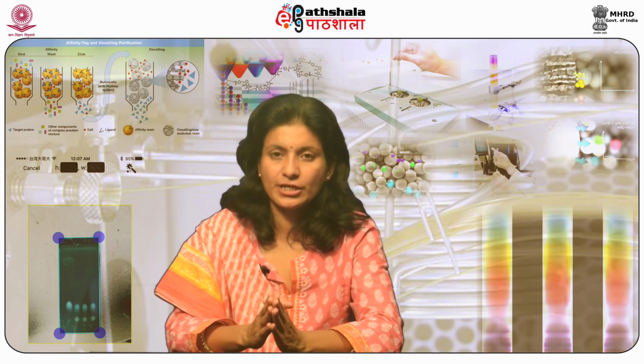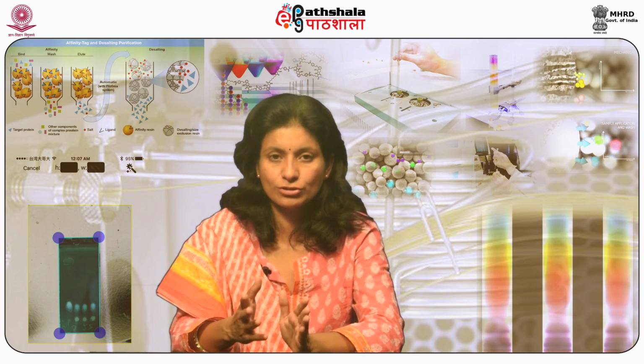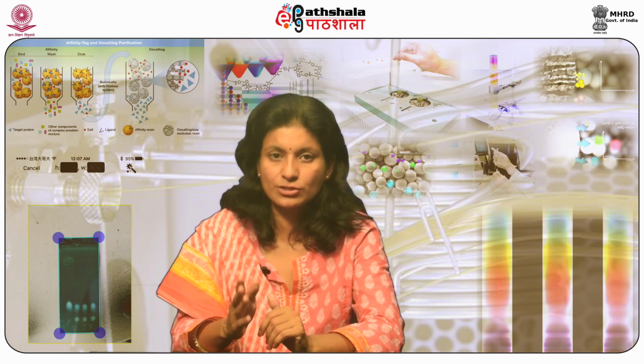Advantages of ion exchange chromatography. This approach has been utilized for the evaluation of anions and cations, implicating metal ions, hydroxyl compounds, peptides, organic acids, nucleotides, and alcohols, etc. It has been successfully applied to the investigation of deteriorated products, raw materials, impurities, bulk active ingredients, etc. at various stages of production steps, in addition to the evaluation of cleaning solutions of production apparatus, desolated streams, container compatibility, including other utilizations.